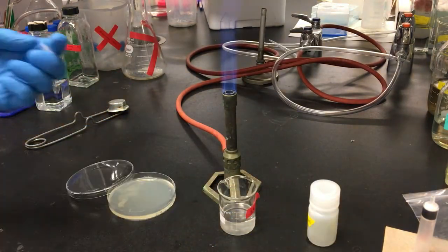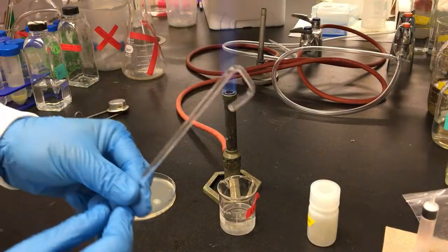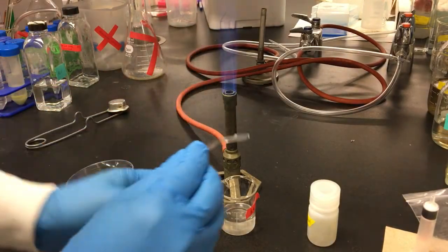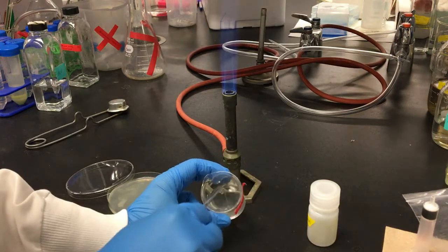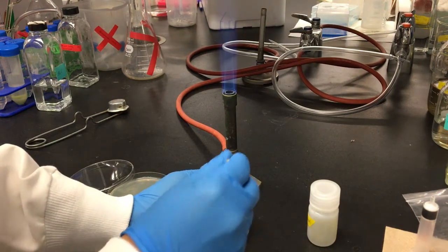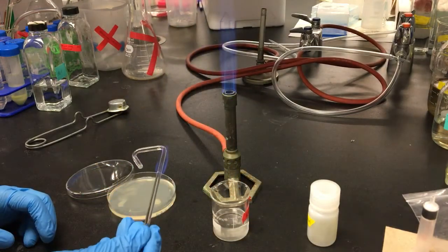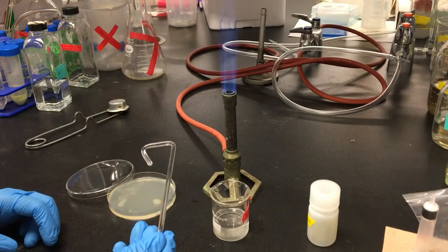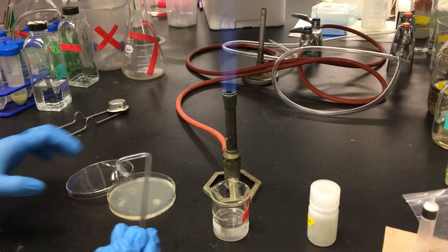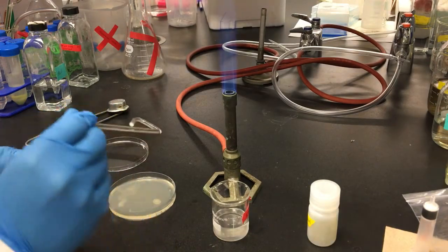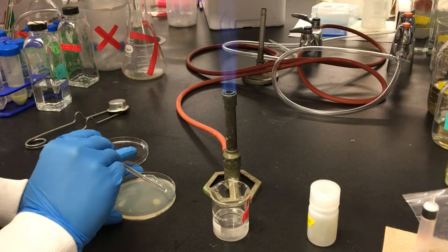I pipette the cells onto the plate and sterilize the spreader by dipping it into ethanol and lighting it. Then, I can spread the cells evenly on the plate.